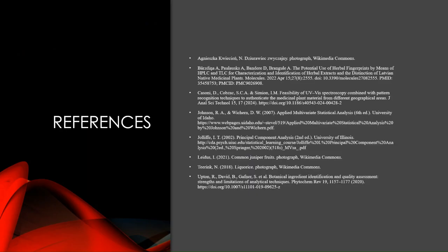There are many bioactive components in these medicinal plants that have been characterized using the absorbance features of the UV vis region. And I think this team successfully proved their idea that this would be a viable option for these smaller companies that are dispensing historically known medicinal plants. It was very interesting as someone who uses UV vis a lot to see what it's truly capable of if applied correctly. Thank you, and I enjoyed reading about these papers.